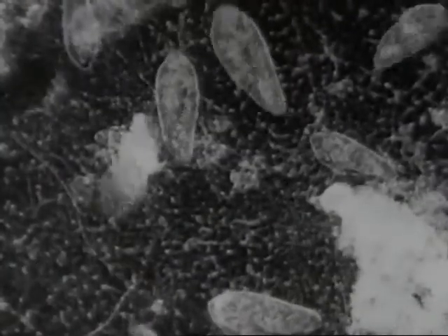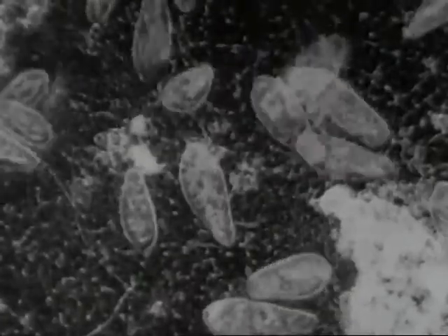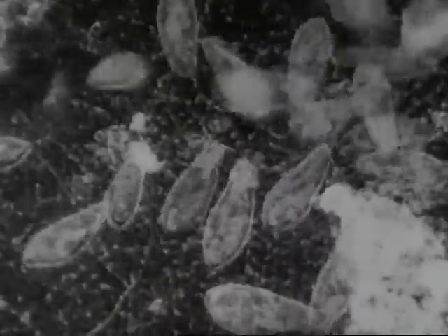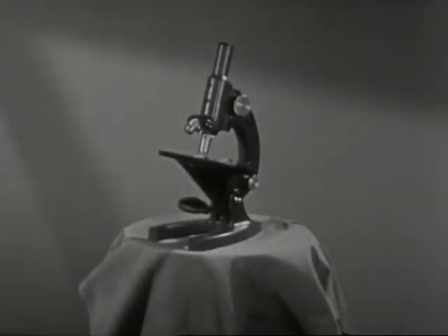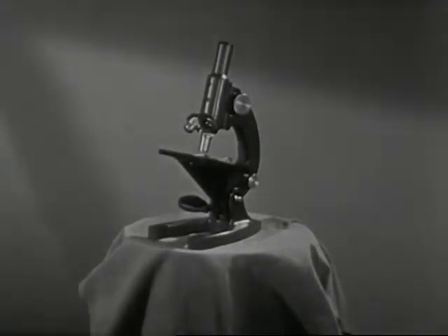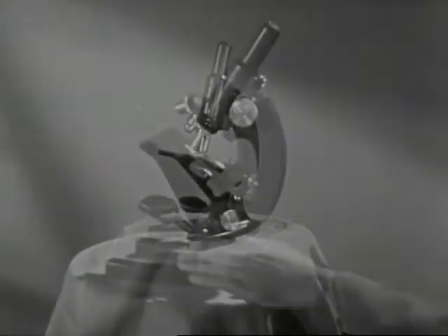A world where a single drop of water may be teeming with scores of one-celled animals. And yet, this strange world is yours to explore, yours to investigate by means of your microscope. As the first step in learning to use the microscope, we must become familiar with the names of the main parts of the standard instrument.